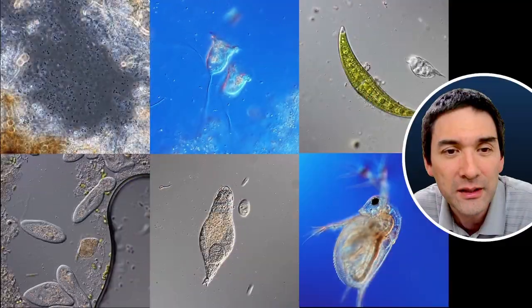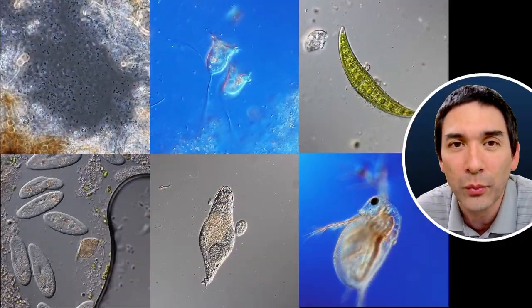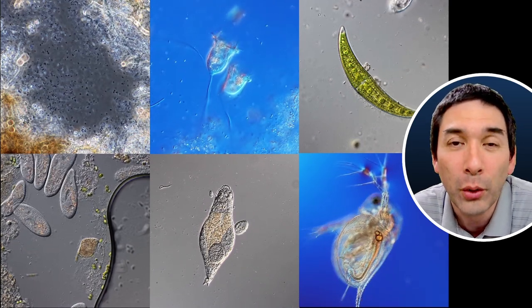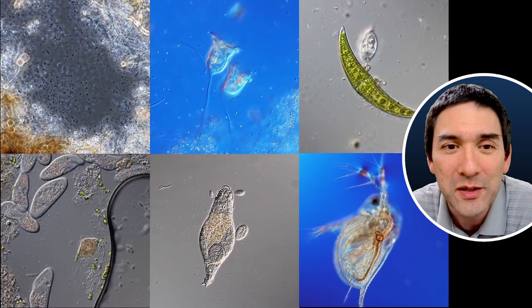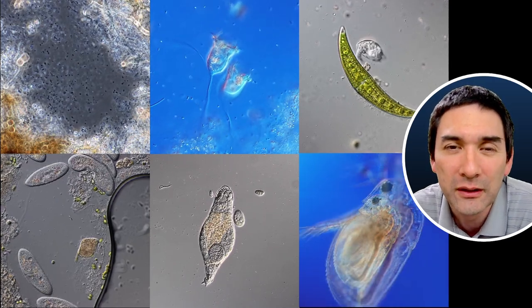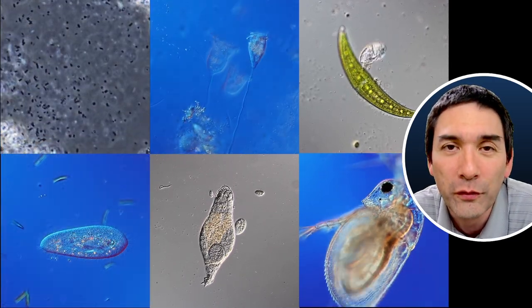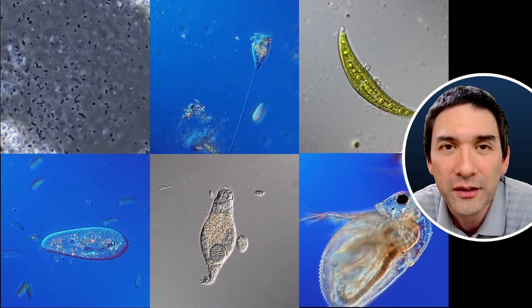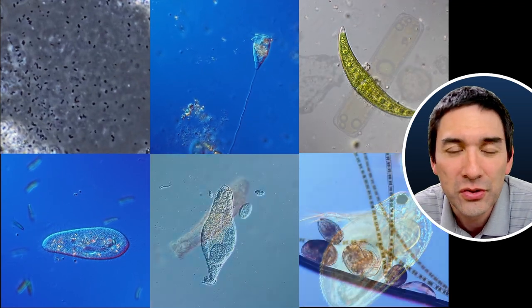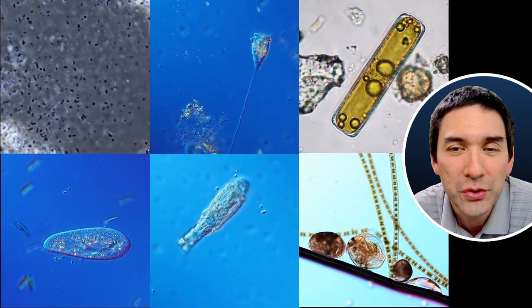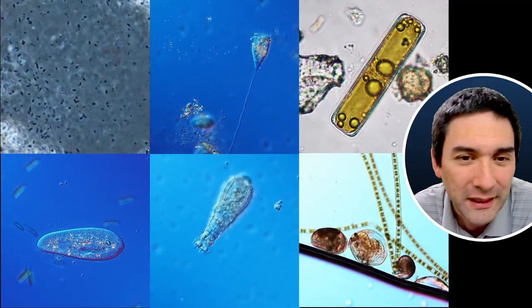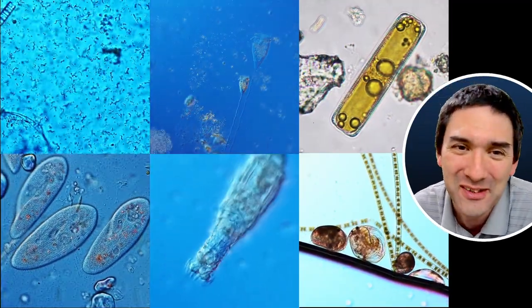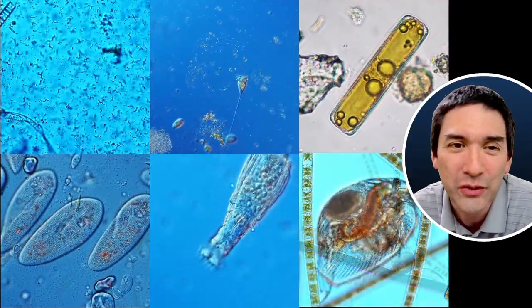And then the last video was a summary video where I wanted to give you a short overview of some very common pond and water microorganisms that you're able to find. So I've given a little bit of an overview here. And here I'm just going to show you six of the specimens that I wanted to share with you. And of course, if you want to know a little bit more about them, then again, I don't have to say it again, you can check the description below. And this is where you can also find the link to the original video.